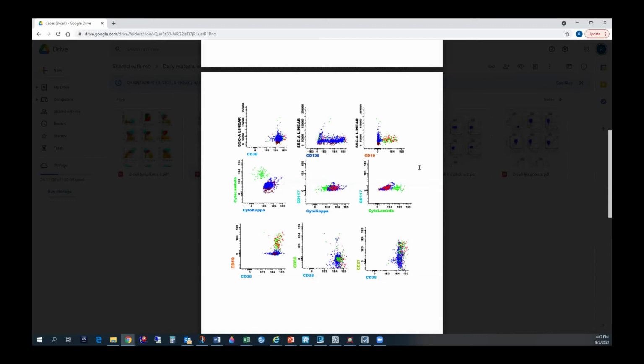Maybe. I'm not sure on this one. It's just that I'm not used to looking at it. Okay, so I'm going to jump in and use a sequence here.